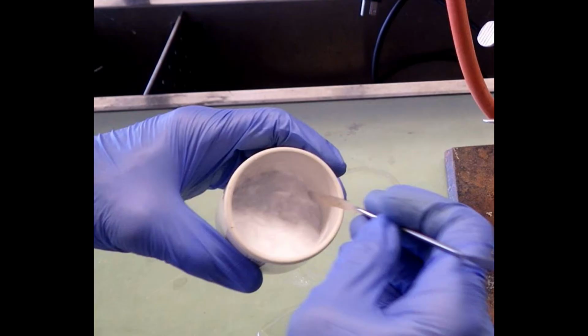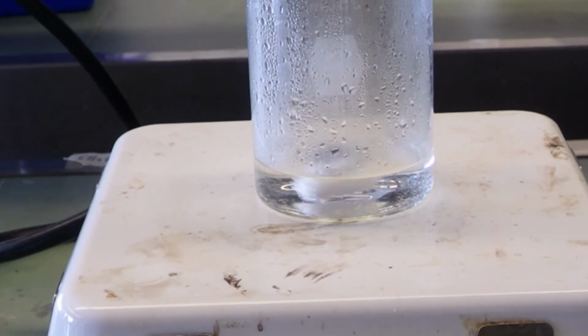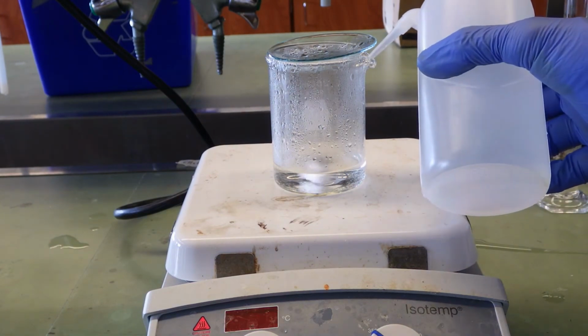At this step, we'll transfer our crude product to a beaker, add 30 mils of water, and heat it to near boiling. Now, if there are any undissolved crystals, we want to put those in solution by adding small quantities, just small squirts of distilled water, keeping it hot.